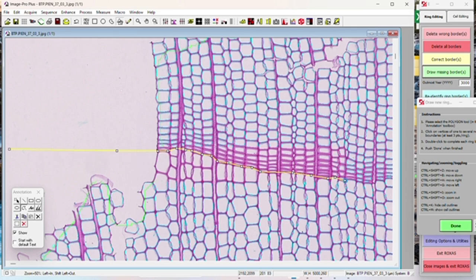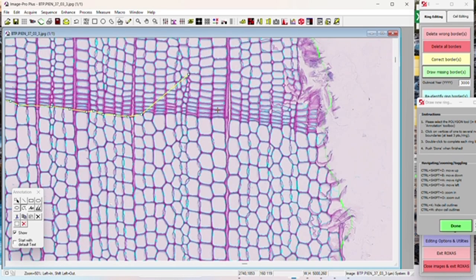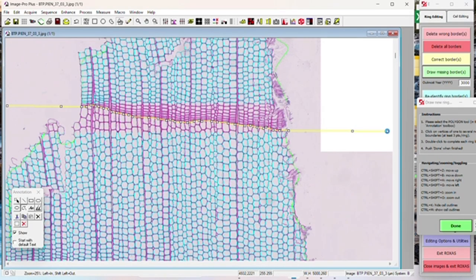There is a way to not have to zoom in and out, where you can use the arrows on your keyboard, but I don't do that. If you have that, that's really good. If you want to know more about that, I can give you the text file that Georg supplied. It goes on your desktop and enables you to use the arrow keys on your keyboard. But I don't do that. I just zoom in and out, which hopefully doesn't make anyone dizzy.